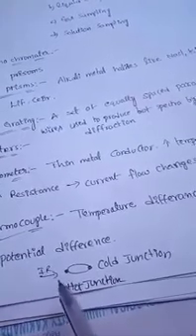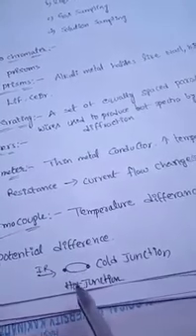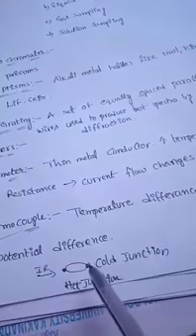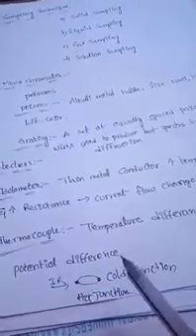The side where IR rays enter acts as a hot junction, and the other side acts as a cold junction. Because of the temperature difference, there is a potential difference. That is the thermocouple material.